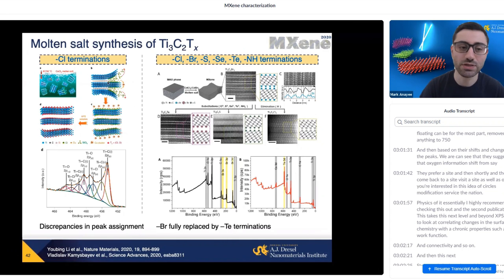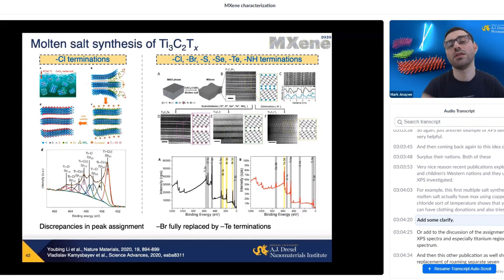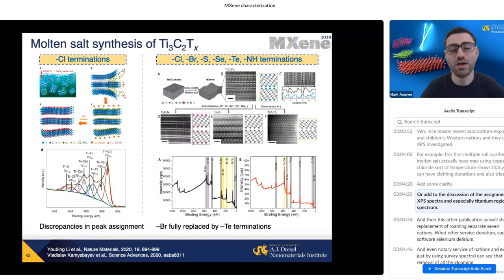This molten salt synthesis, molten salt etching of MAX using copper chloride salt at high temperature, shows that you can have chlorine terminations, and it also tries to clarify or add to the discussion of assignment of XPS spectra, especially titanium region spectra.